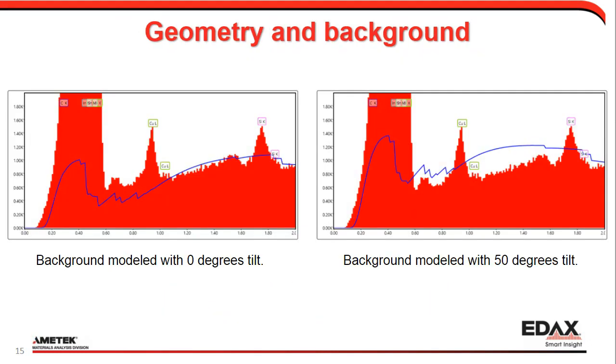Here we have the background on the left-hand side extending very far up, and there's a question of why does that happen? This is pretty much because we're down in the low energy range. This is what I was addressing with the molysulfide sample as well, where we have a flat background. There's very little absorption in the high energy range, but down the low energy range, you get a very high degree of absorption. And what we're seeing here is that you have quite high absorption, but then you see all these steps in the background, and that's as soon as you go below the absorption line for a given element, then the transmission through the sample goes up.